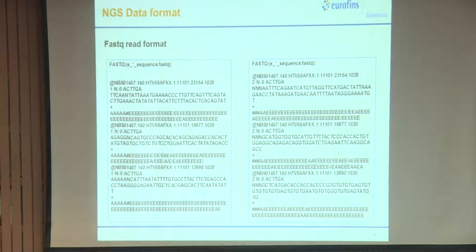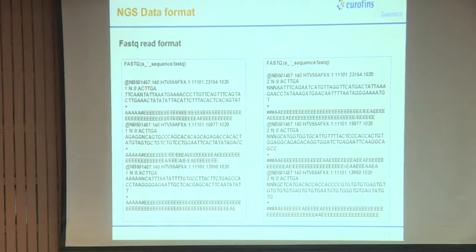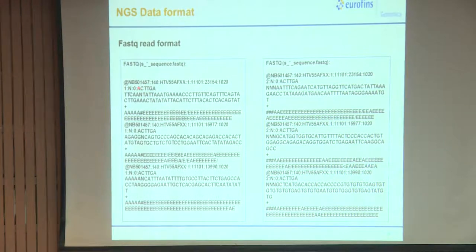And this is how any assembler will identify whether this is my forward read or my reverse read, based on which library you are using. The second thing is the 6 base pair barcode which is written here. You can see it is identical for all because I have taken only one file. So a sample will have identical barcodes, and you can see the R2 also having the same barcodes, right? So based on this we can segregate the samples from a run.